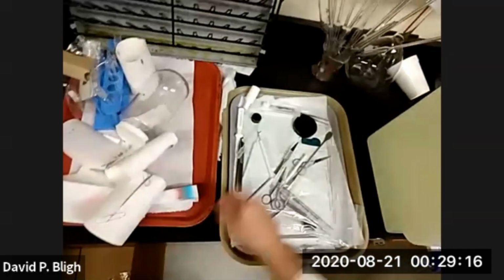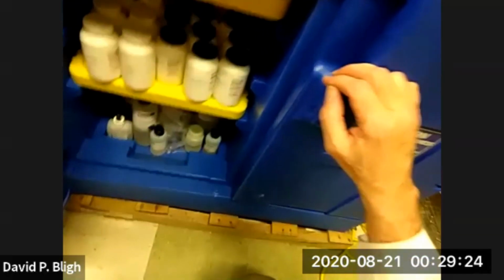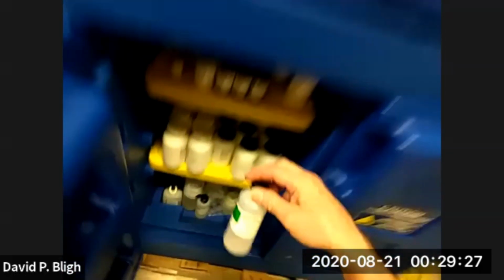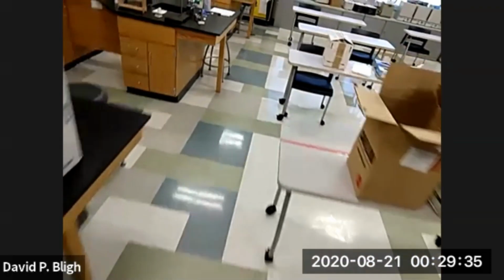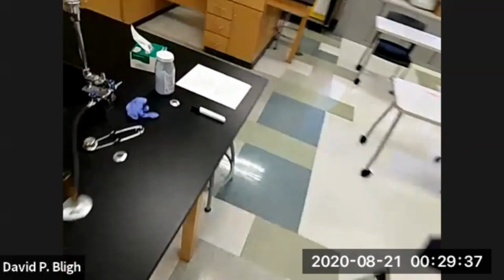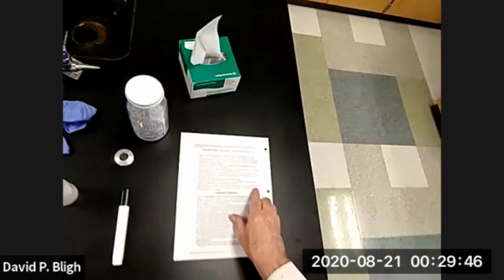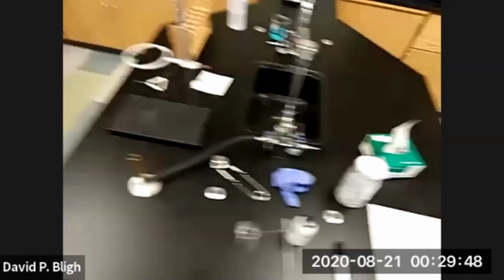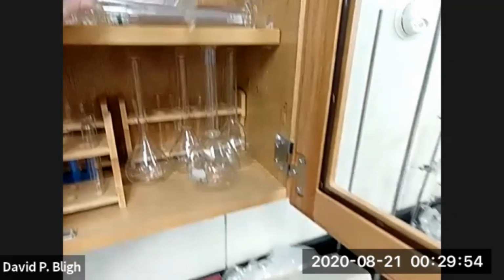We need a dropper and we need acid. Hydrochloric acid, 1 molar. There we go. We're going to need, what did I say? 30 milliliters of distilled water. So we need a graduated cylinder. Measure out 30 milliliters.